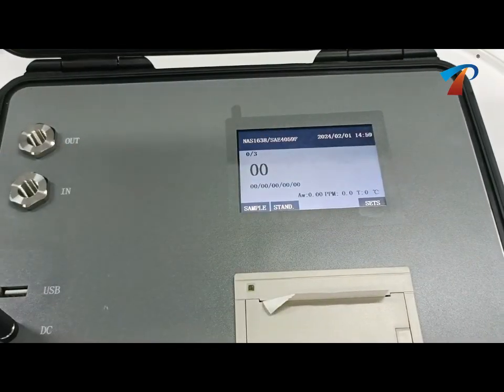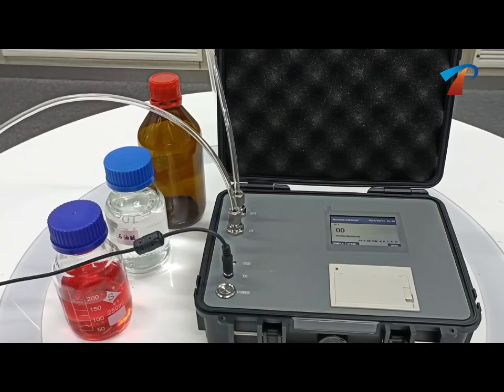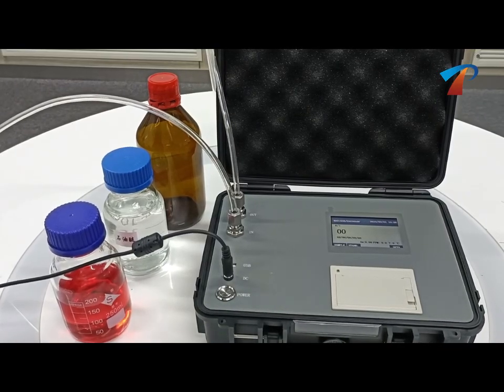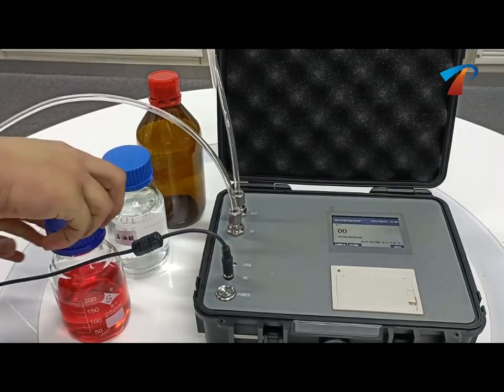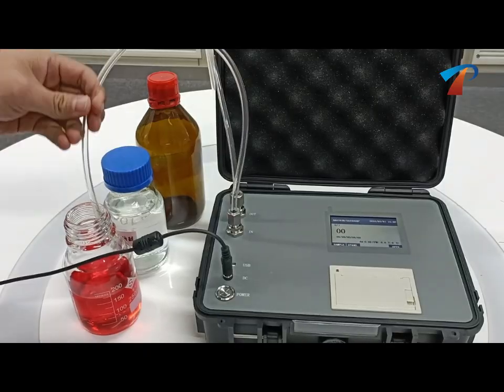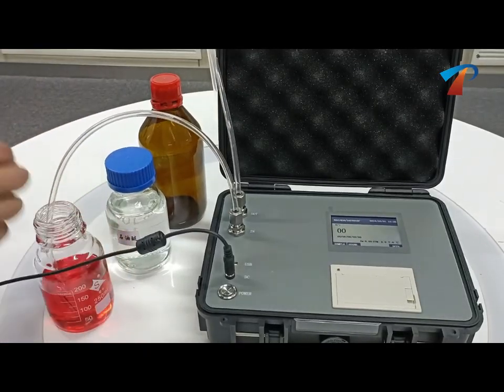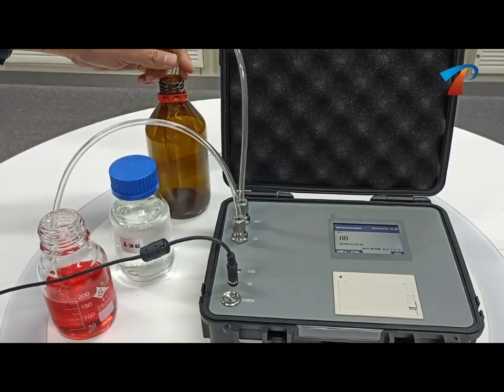Now let's do a test. First, connect the inlet and outlet pipes. Prepare a waste liquid bottle and petroleum ether for cleaning. This is the oil sample we have treated in advance. Put the liquid inlet pipe into the oil sample and the liquid discharge pipe into the waste liquid bottle.